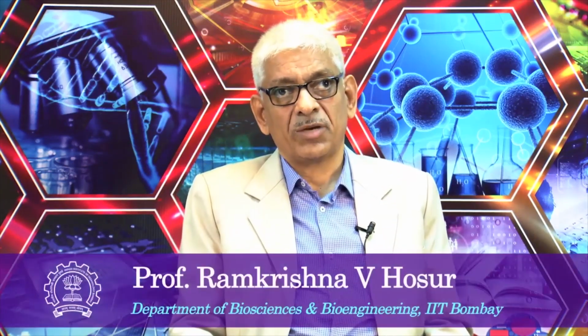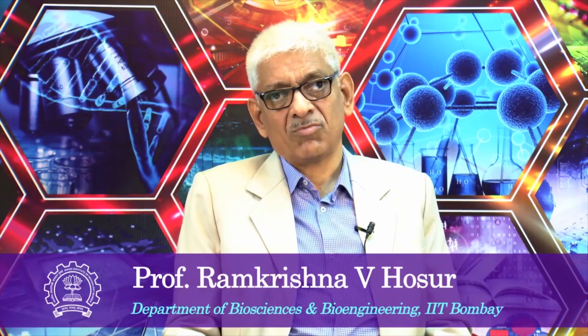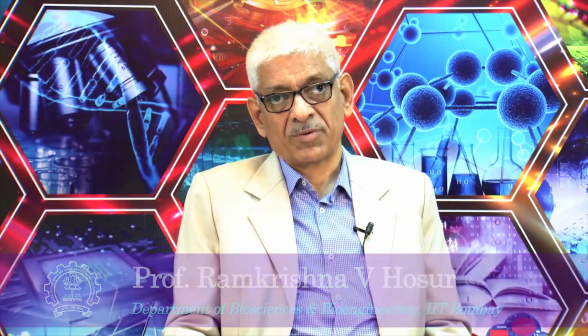We are now going to go over to a second category of two-dimensional experiments, namely two-dimensional correlation experiments. These have been by far the most useful experiments for studying a variety of systems, large systems, small systems, etc., and have been extremely useful in characterizing molecules, understanding the fine structures in the molecules, understanding the connectivities of the individual carbons in molecules, and so on and so forth.